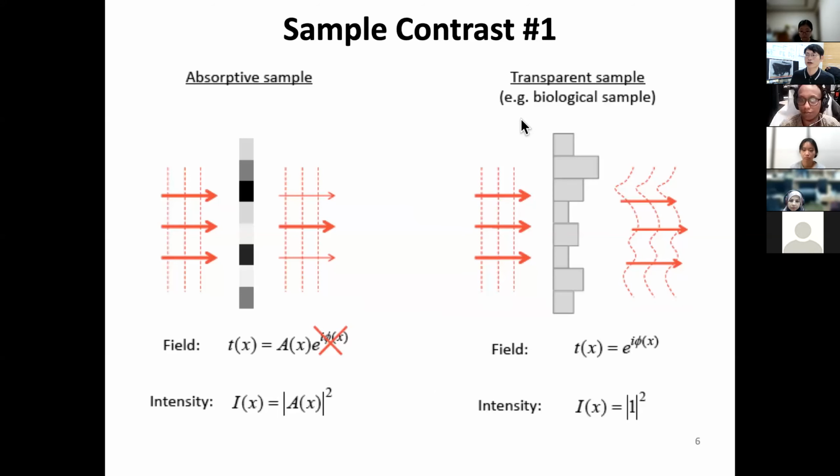Okay, so let's come up with a sample contrast again. I bring the transparency here. You can consider two types of sample, and of course it can be mixed. One is where the sample itself has a color, or the sample itself has an absorption, darkness. For example, this is a good example, an overhead projector transparency film. You can consider it as a gray of the absorption.